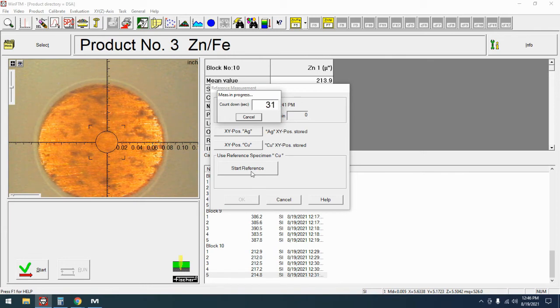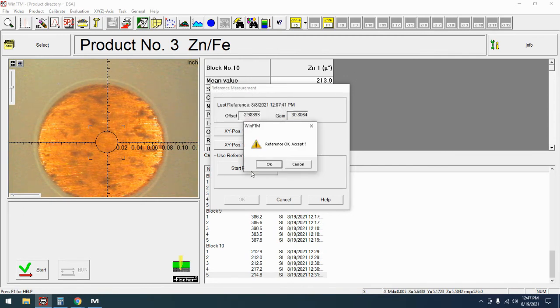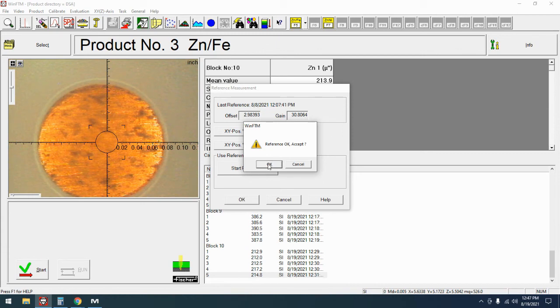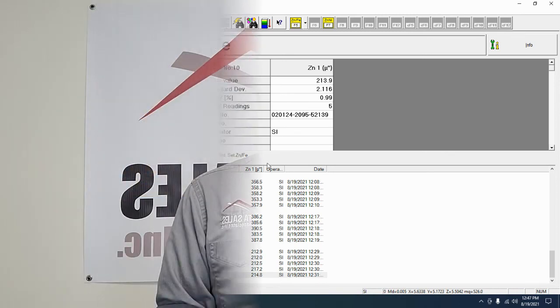One other quick thing to note is do not use the start button on the front of the X-ray to start your reference measurement. The only way to start a reference measurement is from the start reference button. And now that it's finished you can see that it says reference okay accept and obviously at this point you want to hit the okay button. The rest of the reference window will close out and you are all set.